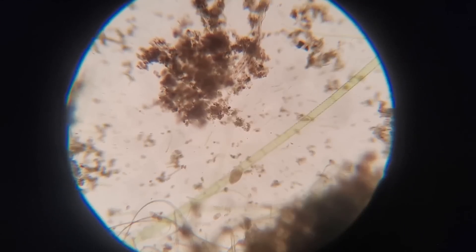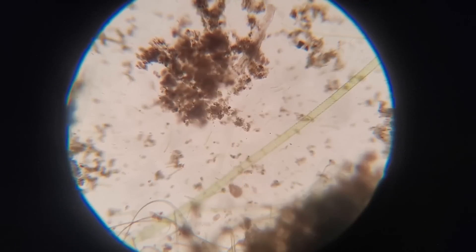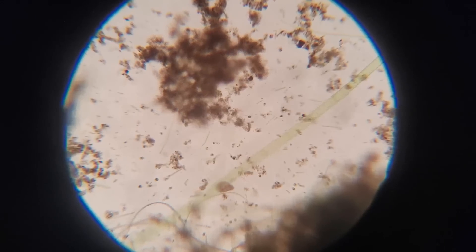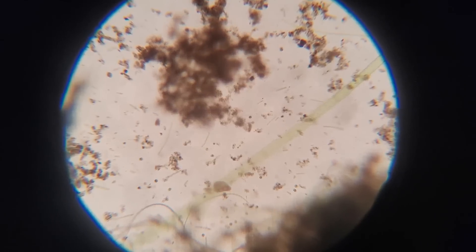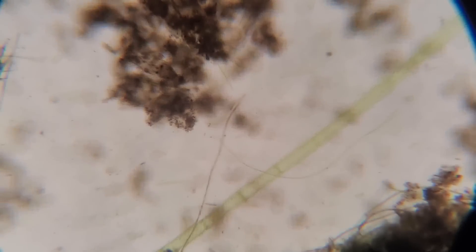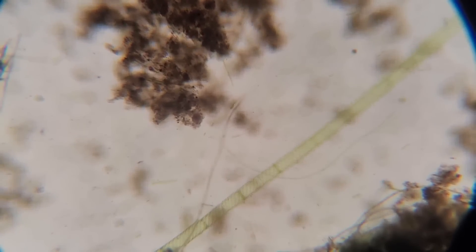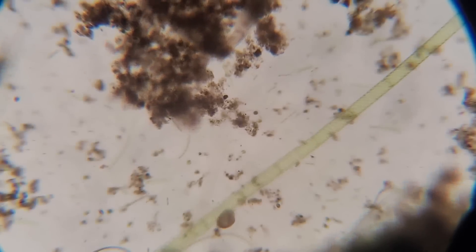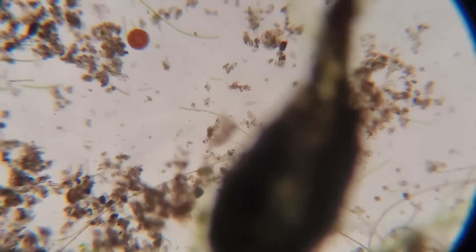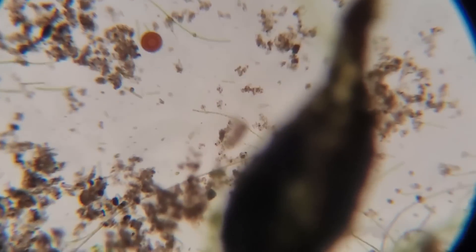Alright, so obviously when we look at the substrate itself, not the filter media, we get all sorts of crazy little life forms. It looks like we have some sort of little rotifer or maybe stentor down on this piece of algae. You can also make out all the different kinds of algae and fungi, and all the little protists and the worms and all sorts of stuff that are living in here, including baby brine shrimp eggs that didn't hatch from feeding.